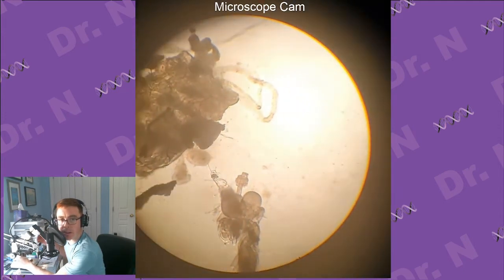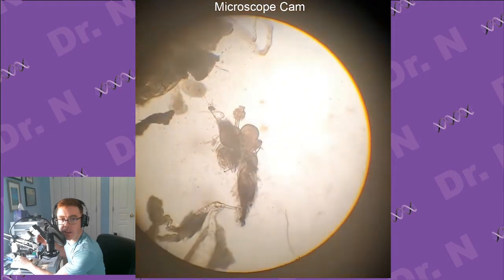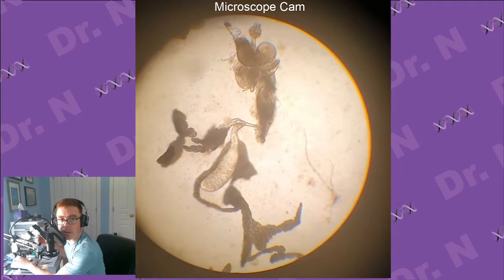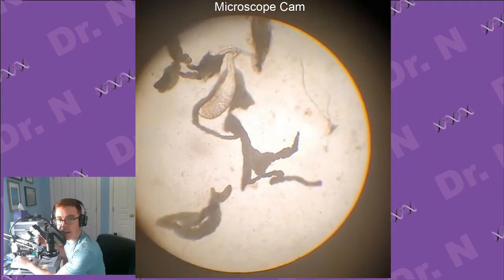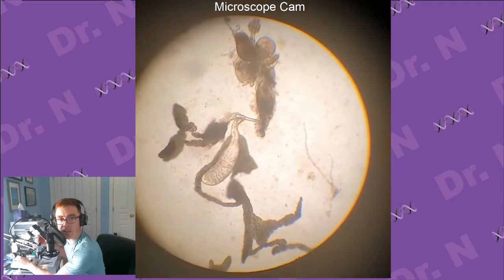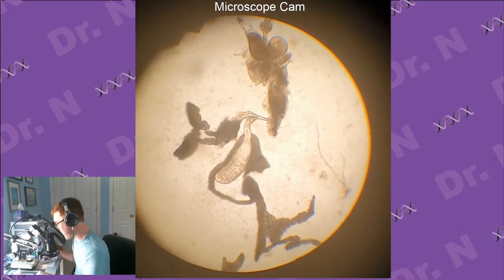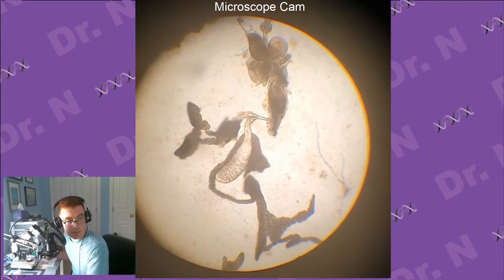Still got the brain right there at the bottom center, connected to the mouth. And then, oh yeah, okay, now I'm seeing where we are. Down here, that's some fat tissue. It looks a lot like human fat tissue, but that right there is exactly what I want. So I'm gonna try and grab that and take it off the slide and put it somewhere else.